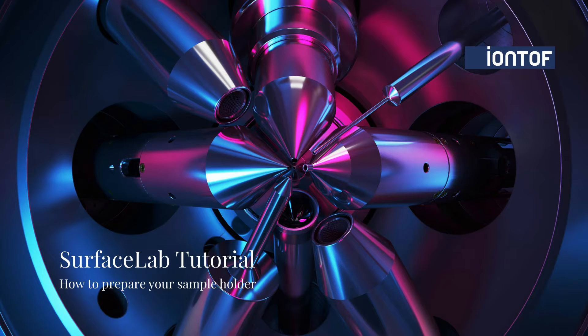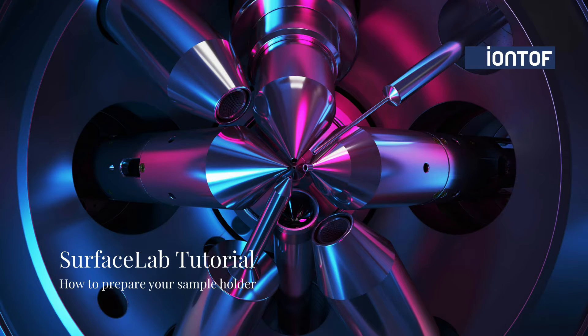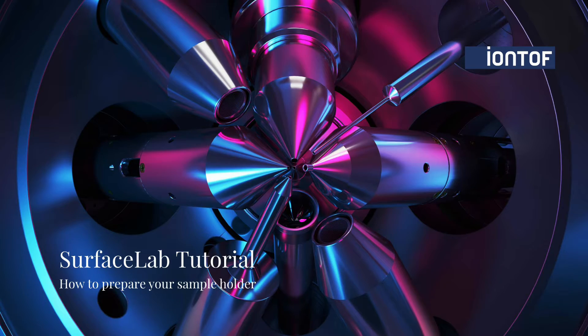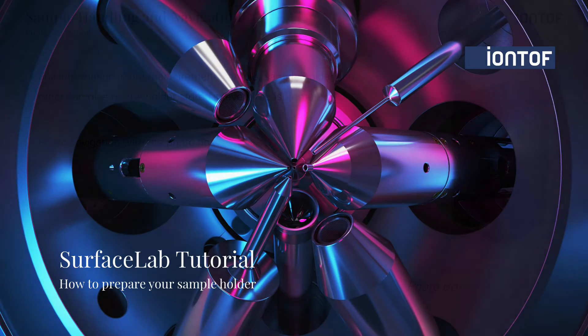Hi and welcome to another IONTOF tutorial. My name is Julia and today I would like to show you how to manage your samples on the sample holder in SurfaceLab.